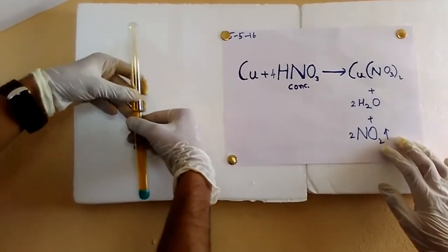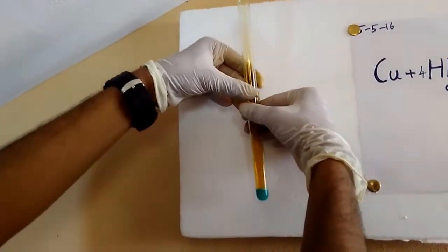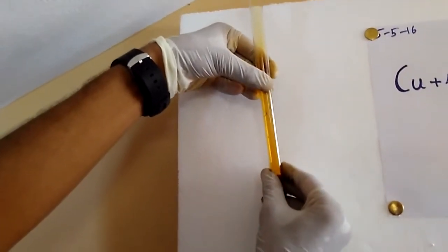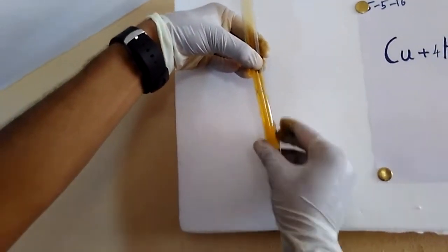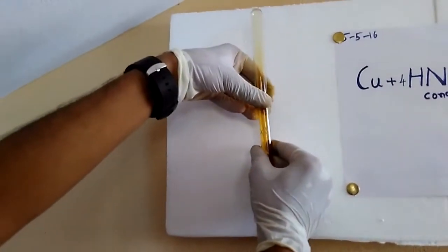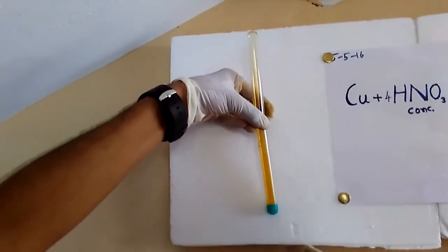Hope you guys liked it. And you can see that there is a good reddish brown gas and a good blue color copper nitrate has been formed. And this reaction is exothermic and this test tube has turned pretty hot. So you can see that there is a good yield of nitrogen dioxide.